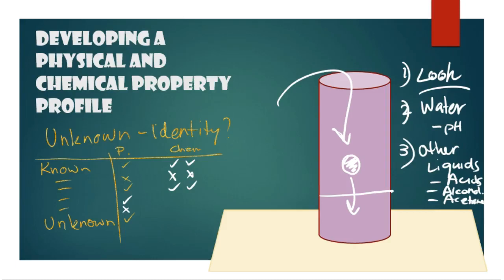Good luck. Make sure that you do each one of the tests carefully, and above all, read the instructions before you do anything. We type them out very carefully, so make sure you do that first. Remember, you'll be getting extra bonus points for people who actually go through and show that they are reading instructions carefully before they do anything in my labs.